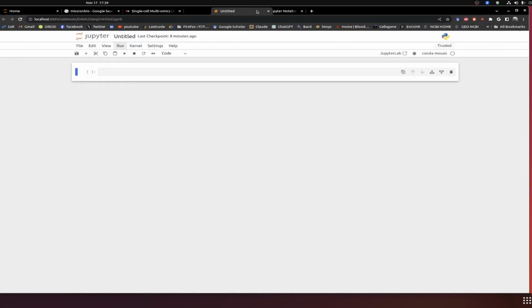So first, you can look at one of our videos where I have shown how to create a specific Anaconda environment that serves the purpose of installing this Jupyter notebook, created at the very first in the Linux system.